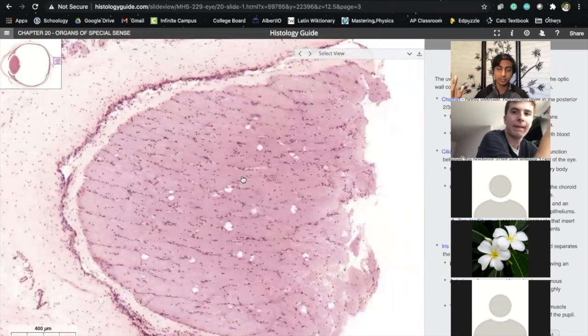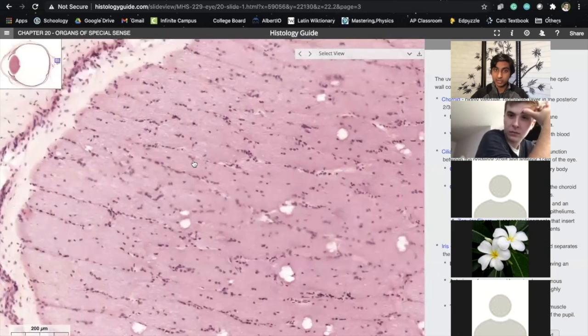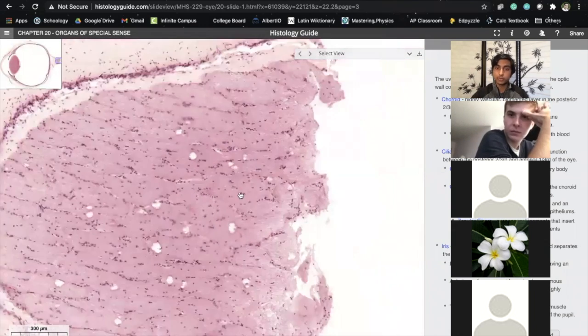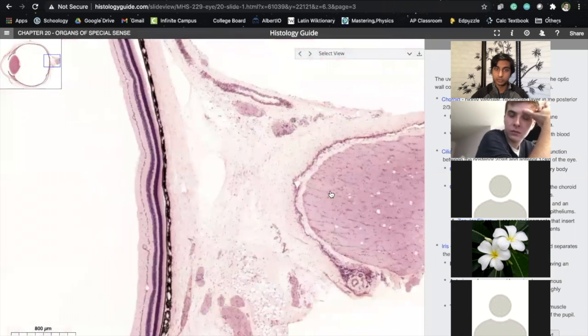It's a bunch of neurons, which makes sense, and neurons are all adjacent and connect. The way it's represented here with the specific dye, and I'm specifically referring to the dye they chose because it'll look different with different dyes, you can see that directional presence, which makes sense if we're thinking about the optic nerve.